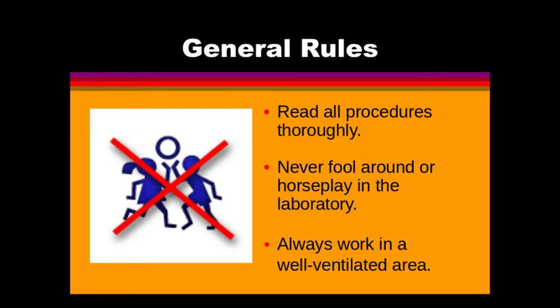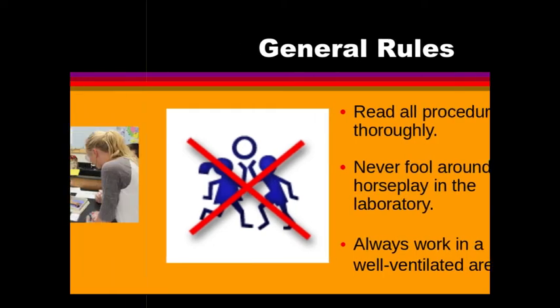Always work in a well-ventilated area. You'll be happy to know that both 8th and 7th grade, we have an exhaust fan, and during COVID, I've been running it every day, so it helps circulate the air in our room.